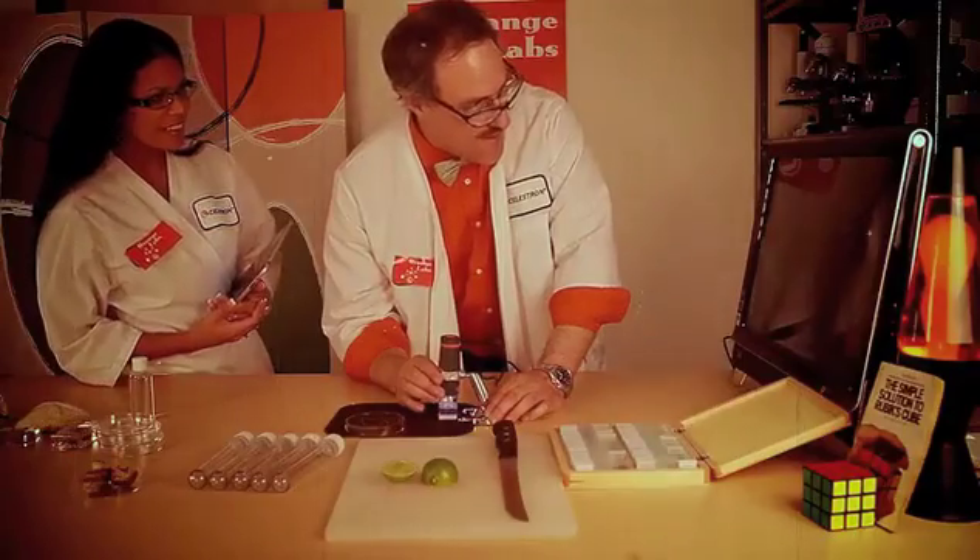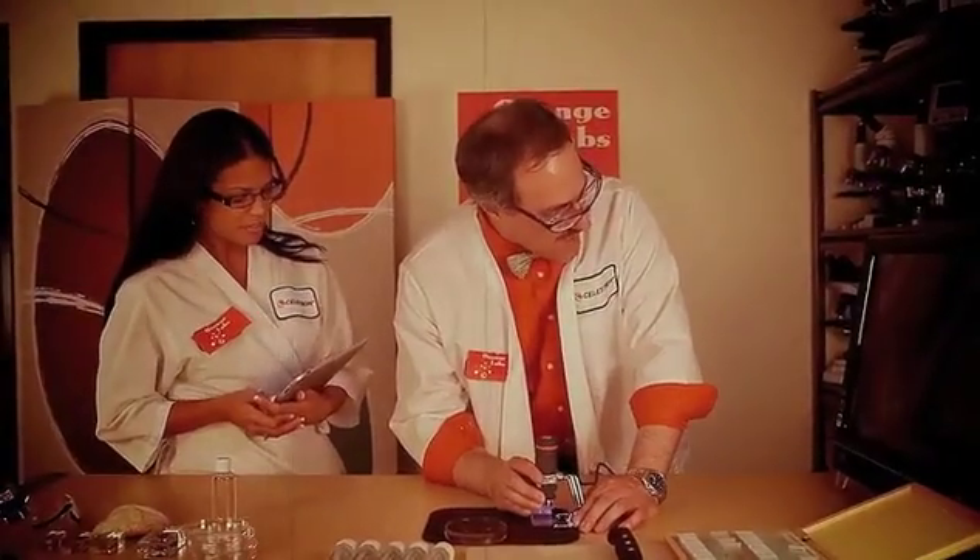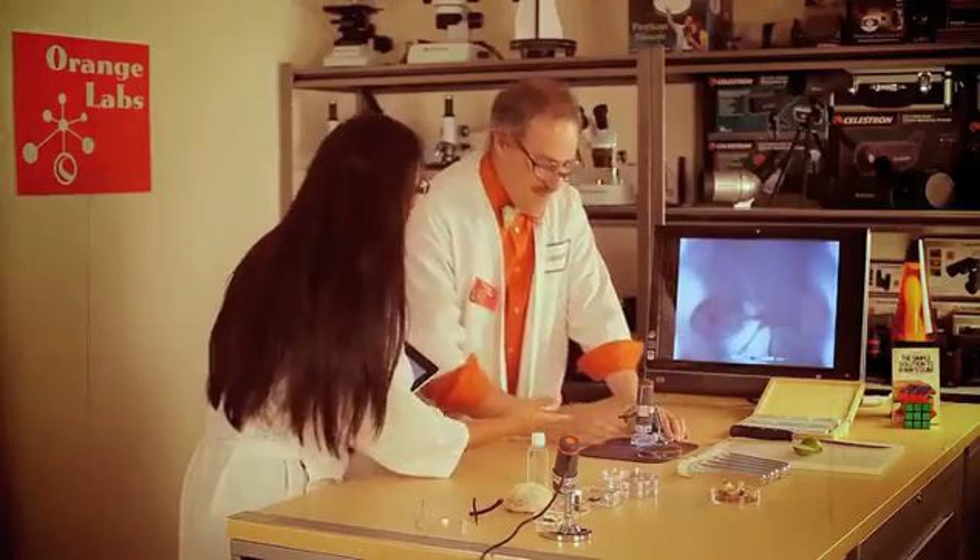Hi Professor Oh, what are you working on? Hello, Wyatt. I was just about to explore my latest discovery, the electronic physical microscope from Celestron. It allows you to see all kinds of things, like this ant here. It's fabulous. It's stupendous. Why don't you just tell them about the microscope?